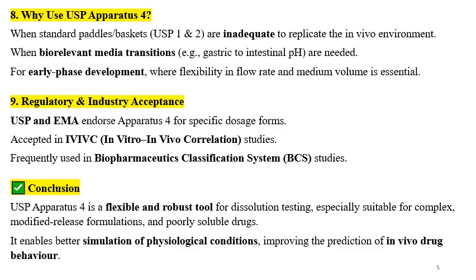In conclusion, USP apparatus 4 is a flexible and robust tool for dissolution testing, especially for complex formulations: complex designs, modified release, controlled release formulations, soft gel formulations, and it is also more useful for poorly soluble drugs.